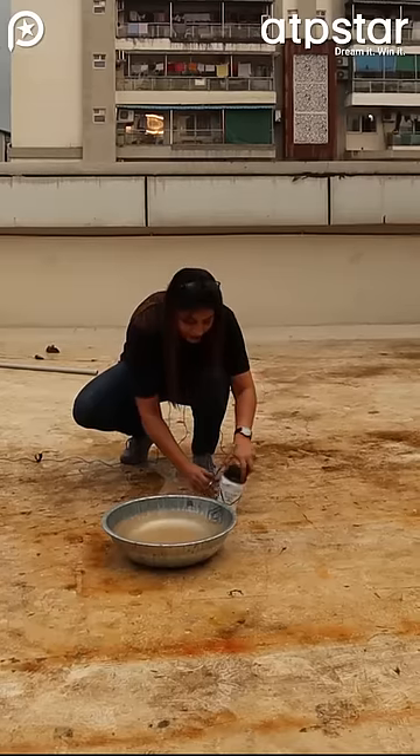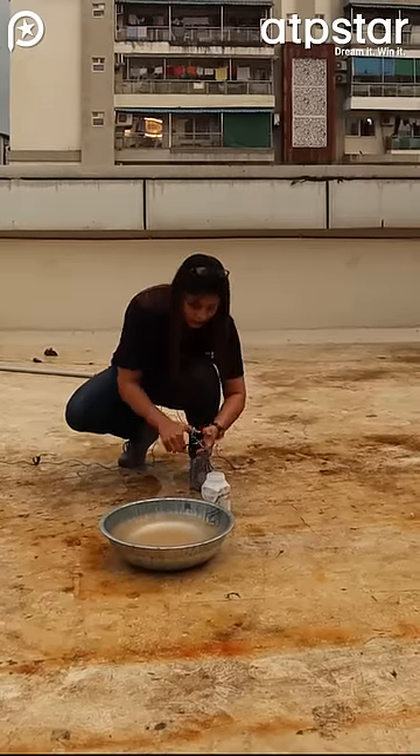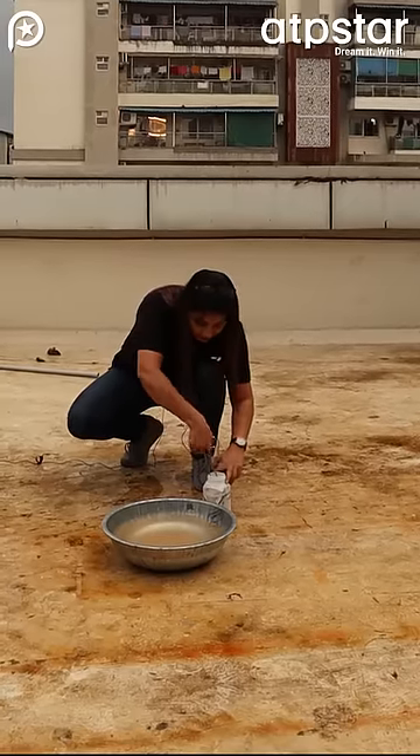It is a little risky. It is not recommended that you try this at home. We have taken it here and we are going to add sodium.